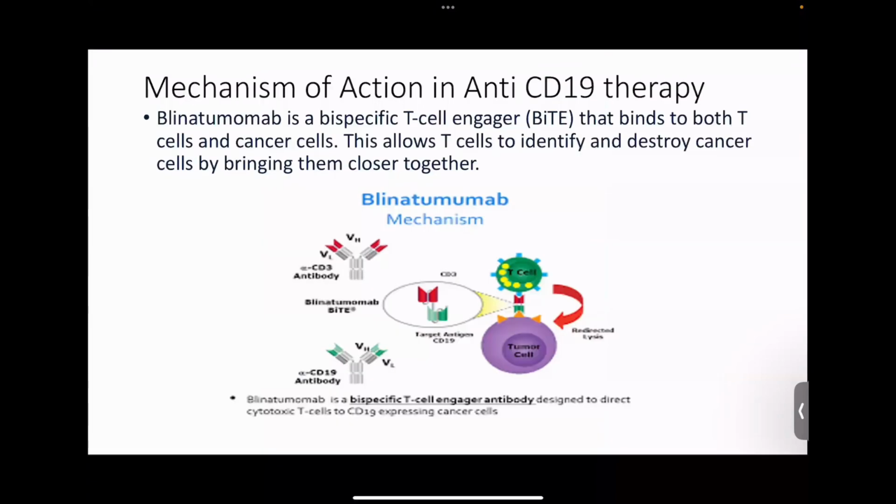Whenever we are analyzing a case of B-ALL MRD, we have to analyze the CD19 positive cells, that are the CD19 positive blasts. So basically, from the B-ALL MRD, we have to analyze if the residual blasts are actually abnormal B blasts or hematogones. We can differentiate between those two with the help of LAIP markers, which we'll see.